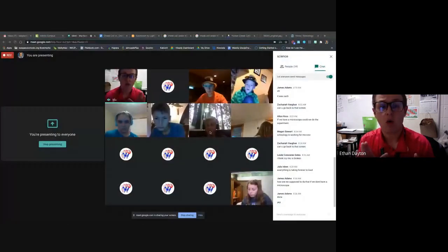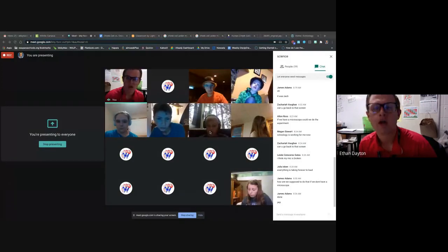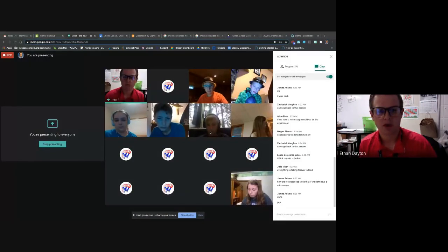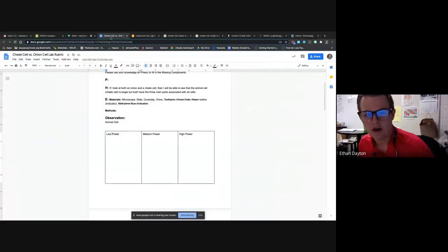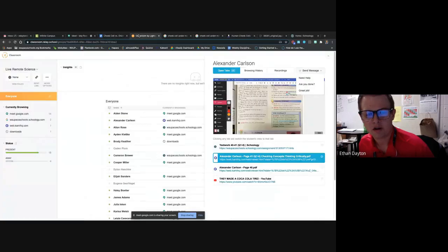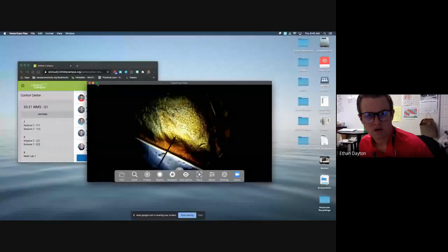Plant cells have a cell wall, made up of cellulose, which is more rigid and gives a more uniform shape. So that's why. Hopefully you got that drawn under low power. Then I will go to medium power. Let me get on this again. Here we go.